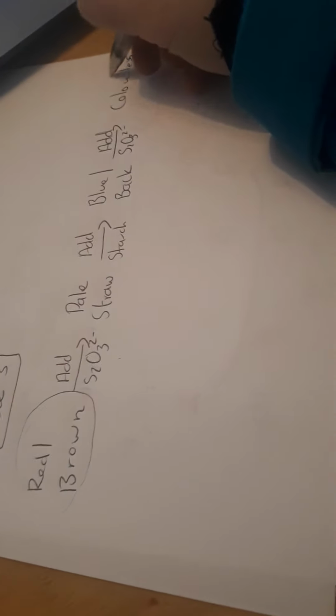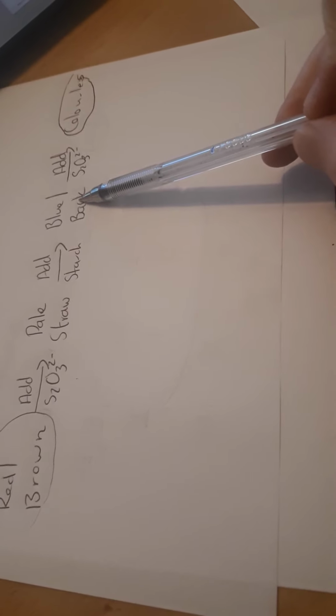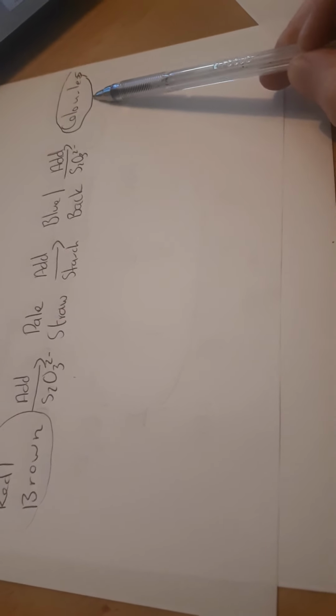The overall volume is going to be only the amount it takes to go from red-brown to colourless. Okay? You need to know the sequence that it goes from red-brown to pale straw. You add your starch, it goes blue-black because iodine is present, to colourless. So you need to know that sequence.